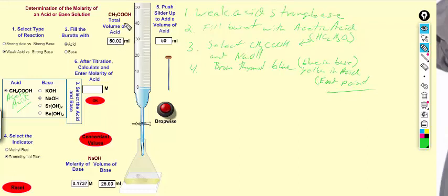And so clearly I over titrated this, but if we were to do this a 3rd time, you're going to do this in triplicate. What you'll select then is, don't select reset, select concordant values. So what we have here is acetic acid of unknown concentration, but if we select concordant values, the molarity of the base will be the same, as will the molarity of the unknown acid. So here we go. Notice the molarity of the base has not changed. Makes life a little bit easier for you.